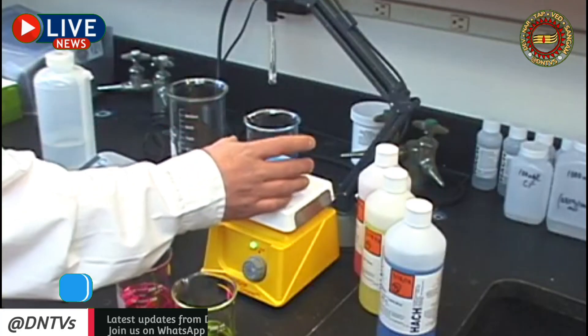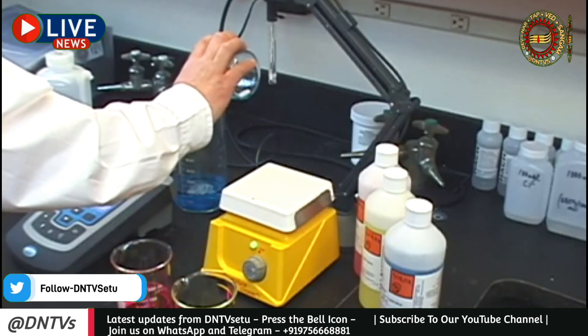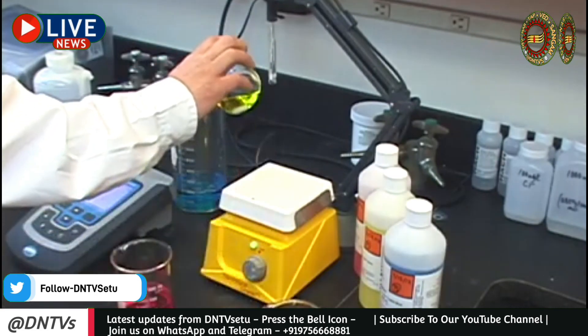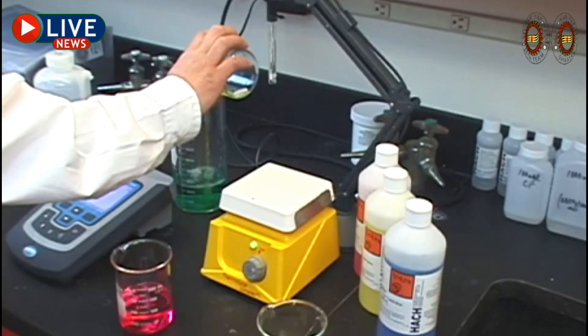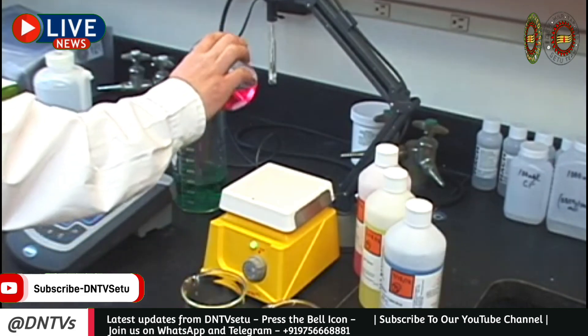When you're finished, do not pour used buffer back into the original container, as this will contaminate your buffer solution. Each time you need to calibrate, new buffers should be used. Remember, buffers are inexpensive, but errors introduced to your measurement are not.